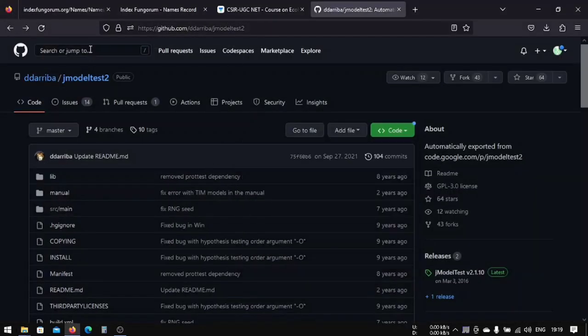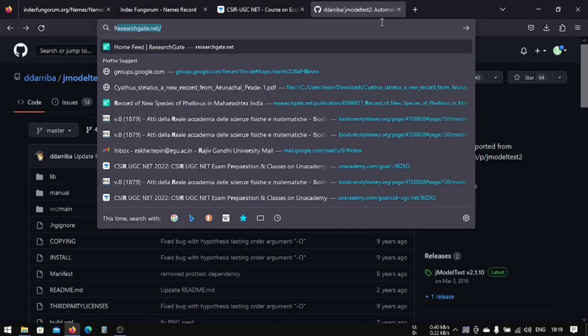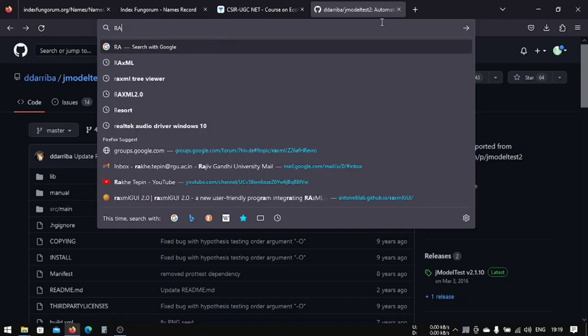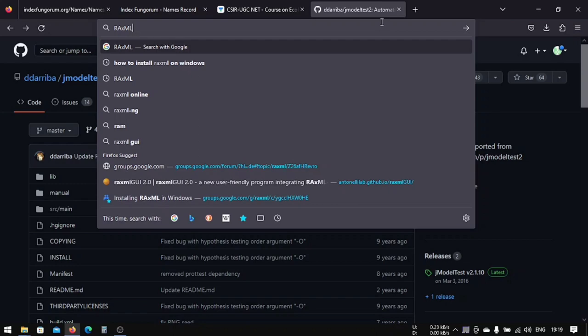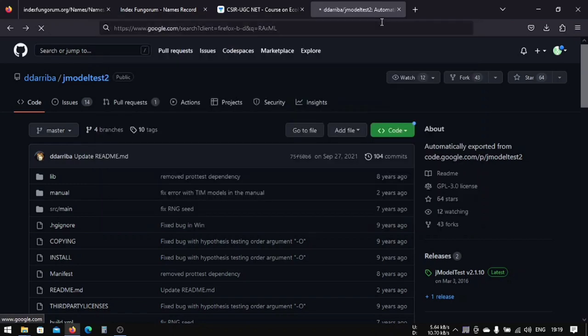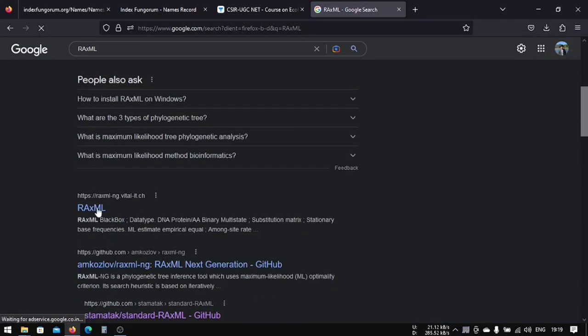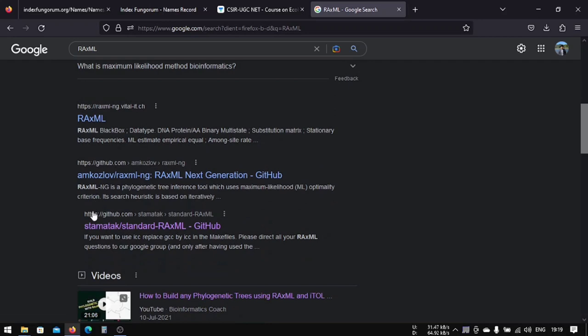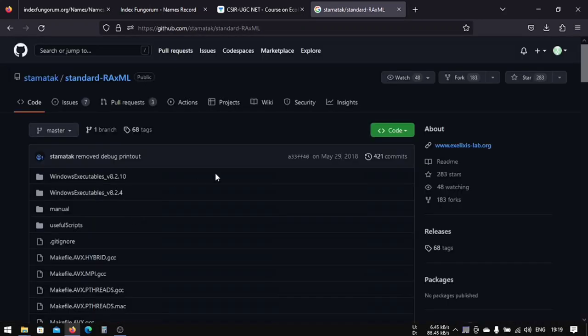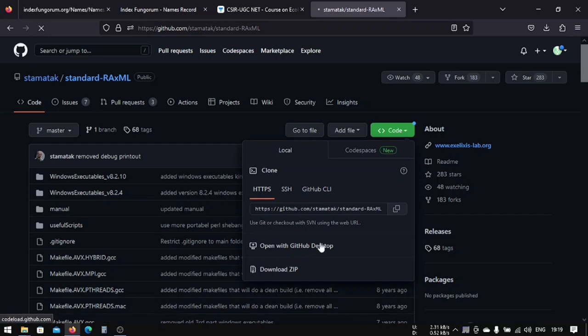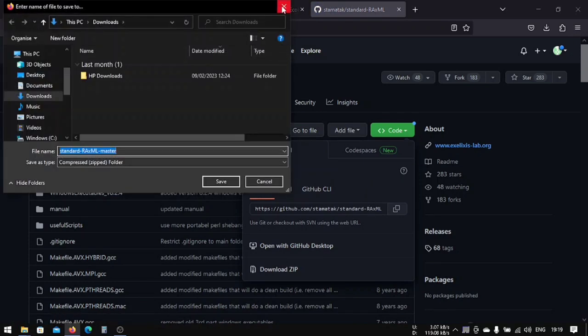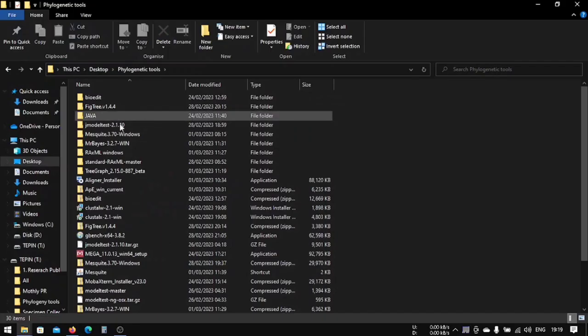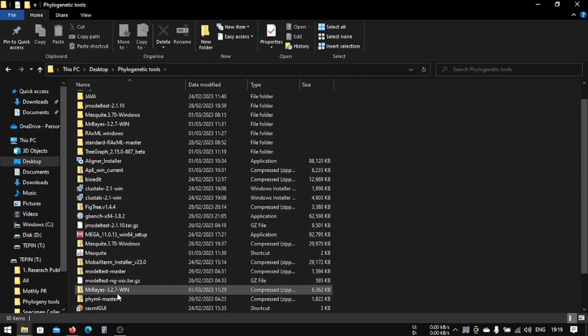For that, you have to download another file, that is RAxML. You can download this from this GitHub. Save this code and download zip. I have already downloaded it, so this is the file that after downloading we will get.